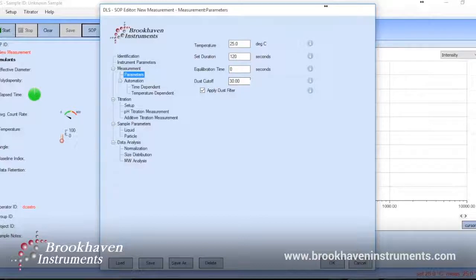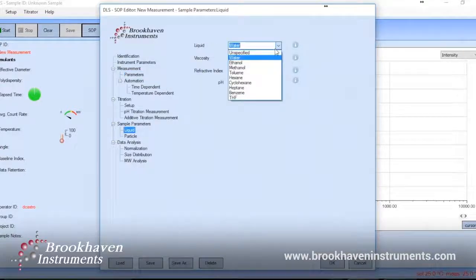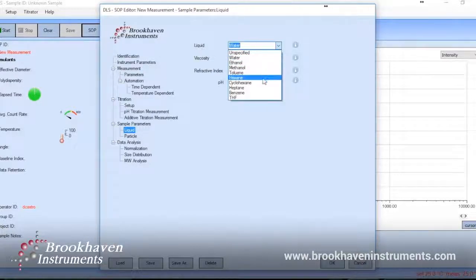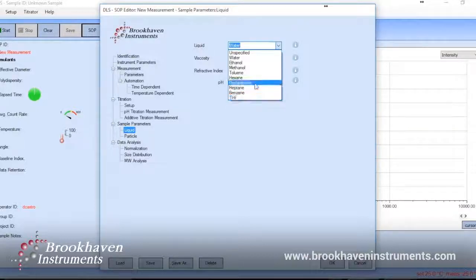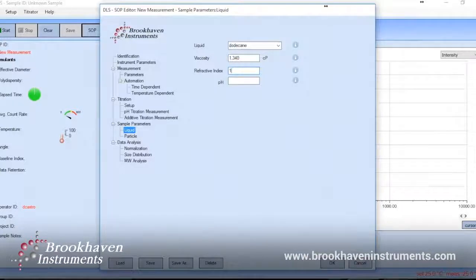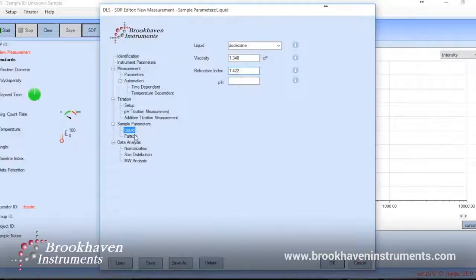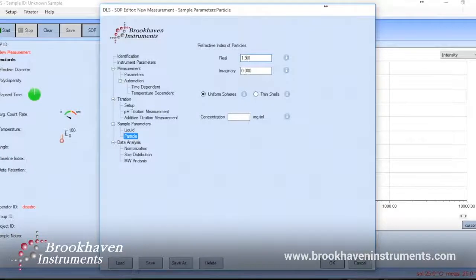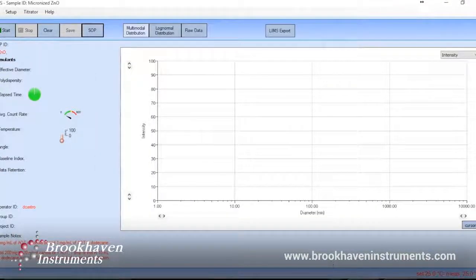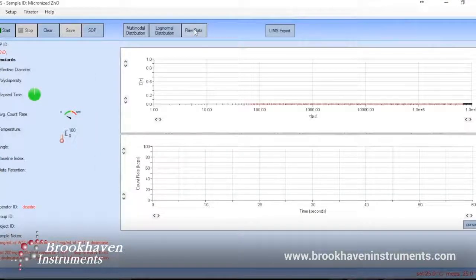We also input information about the sample itself. In the liquid section, if the solvent is one of the nine standard liquids already in the software, choosing one will automatically update values specific to that liquid, such as refractive index and viscosity. Since we were using an oil not listed, I found its values at 25 degrees Celsius to input manually. These values are required as they are used in calculations. Once you're done filling in all the desired information, you can close the SOP and have the option to save it for future measurement use.